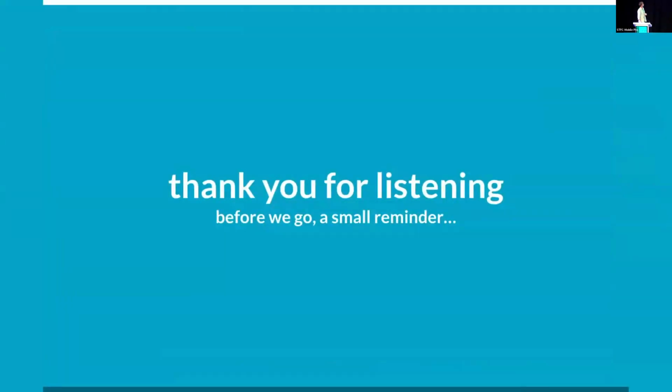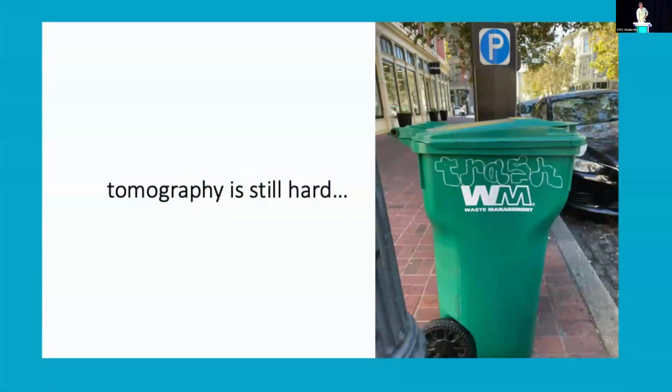Yeah, that's everything I had to say. I hope I didn't rush through too much. Small reminder, just because we have nicer and nicer tools does not mean that tomography is easy. It's complicated biology. The floor on the complexity for tomography problems is definitely much higher than what you get in single particle. And we need to recognize that you might still have to do some custom stuff, or it might not be easy to get these results for all projects.